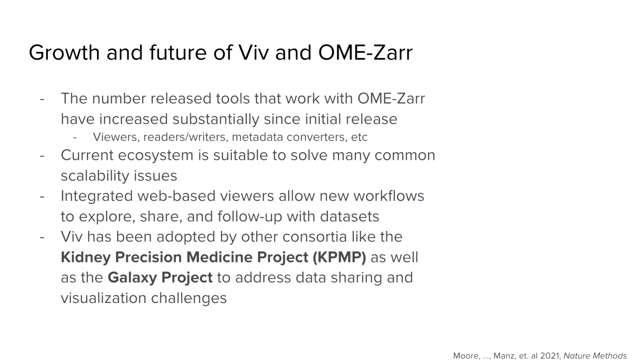And in terms of visualization, the integrated web-based viewers allow these new workflows that we're still exploring in my research, to both share and provide web-based views to these computational backends that typically weren't possible before.